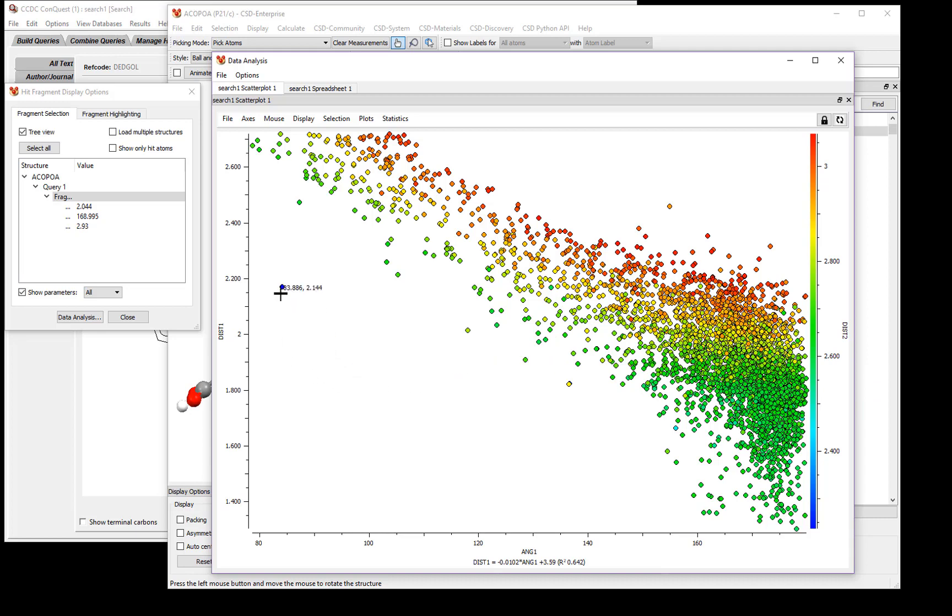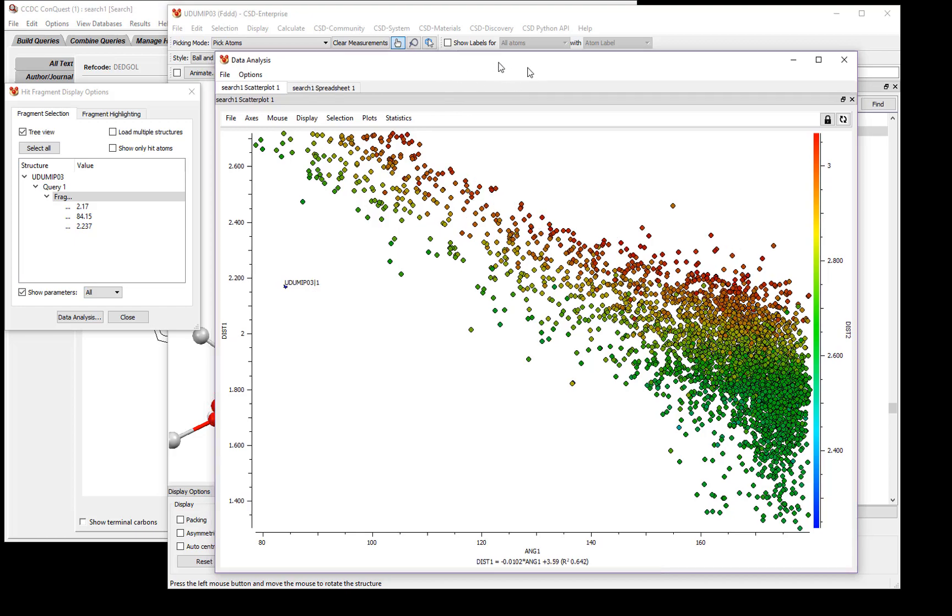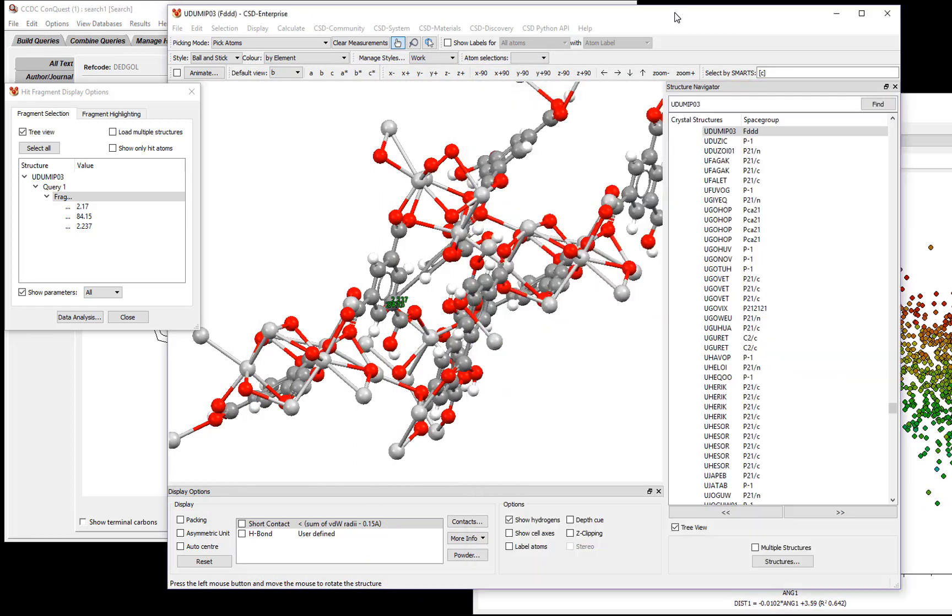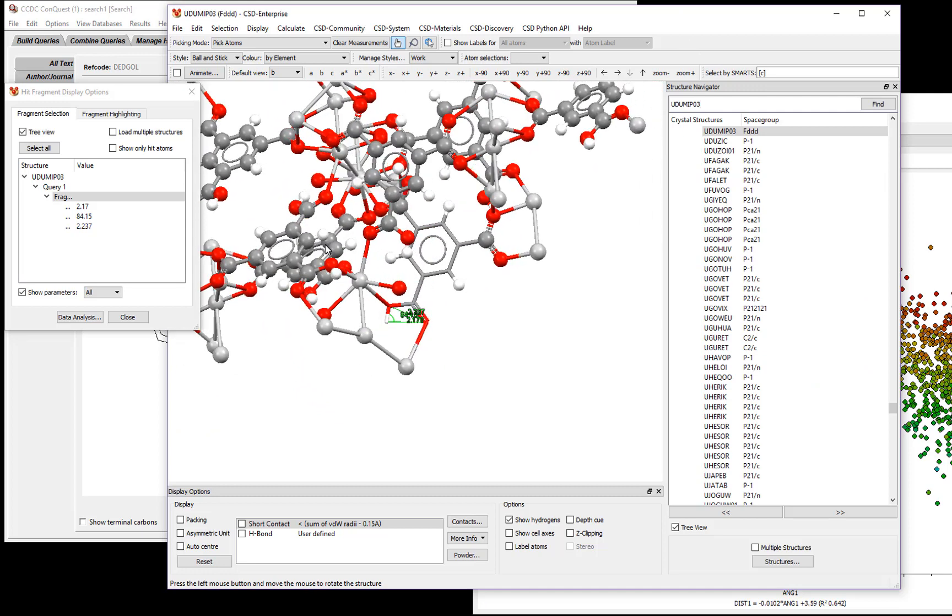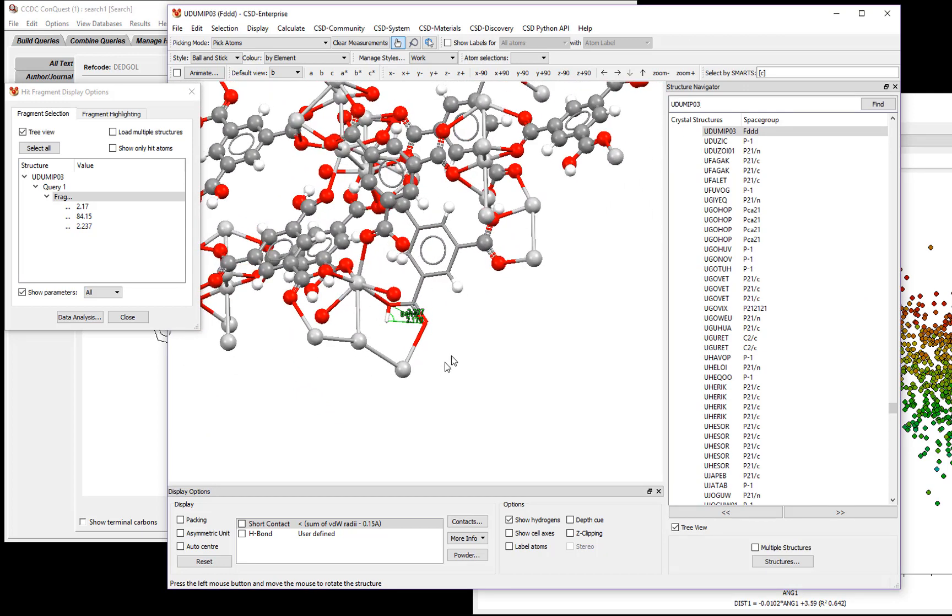If we look in the Mercury window behind our spreadsheet, we'll see that the structure has been brought up in the Mercury Viewer, and we'll notice right away that this is not a typical organic molecule.